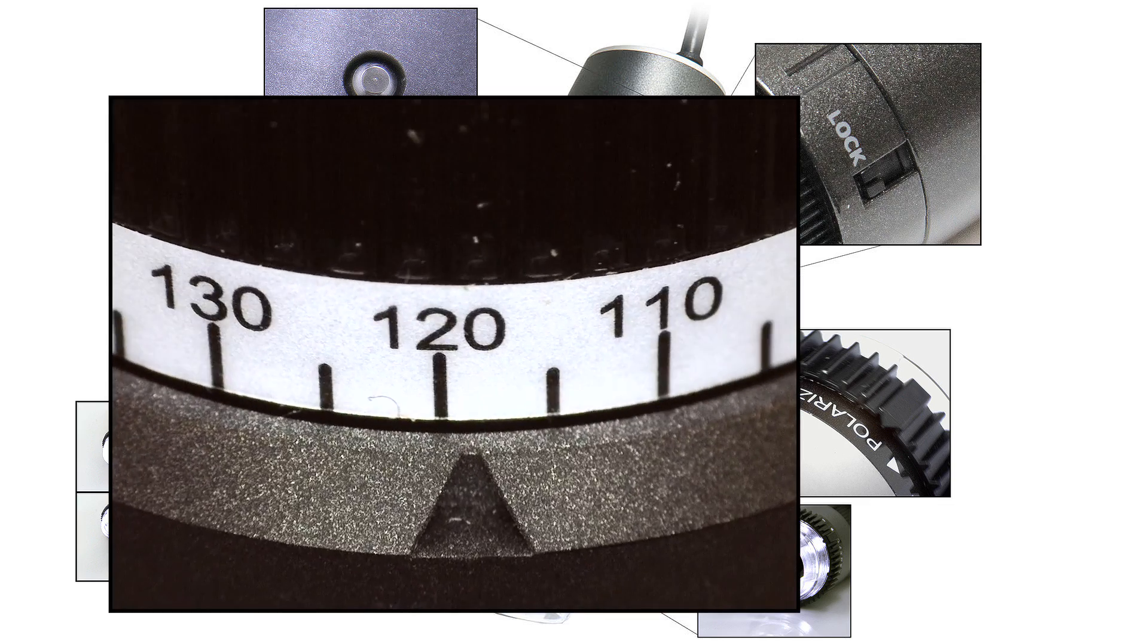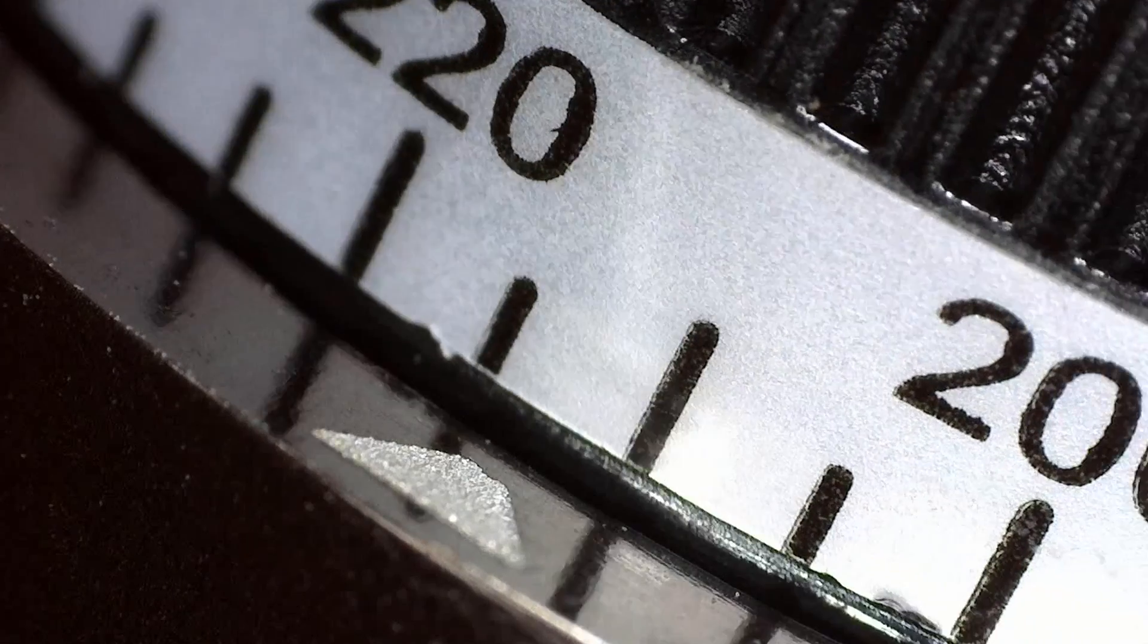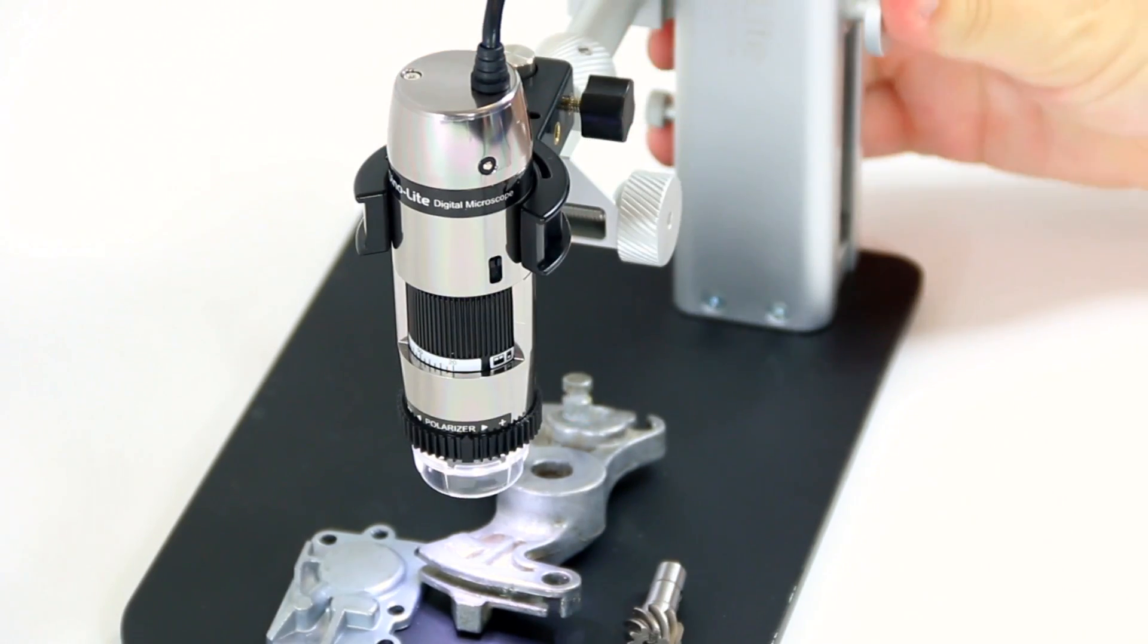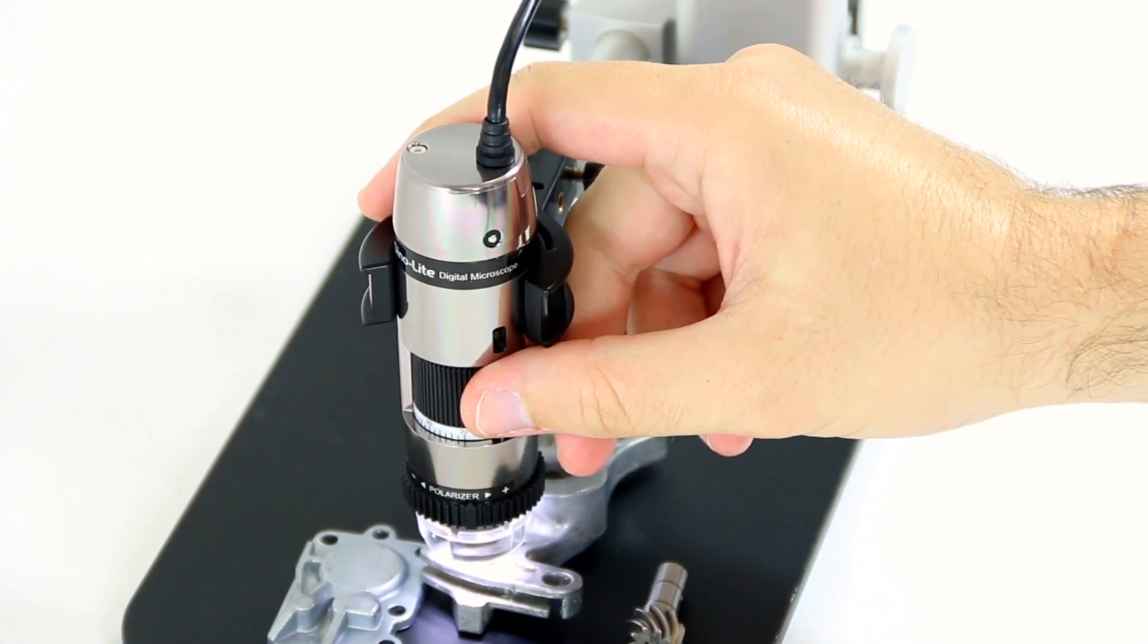Like a traditional microscope or camera lens, Dynolite microscopes focus based on the magnification and distance to the subject being viewed. This is known as the working distance.